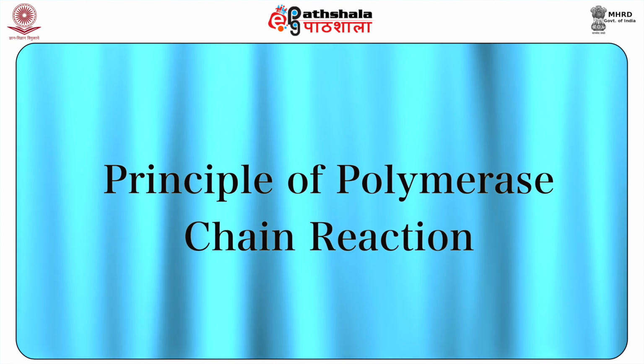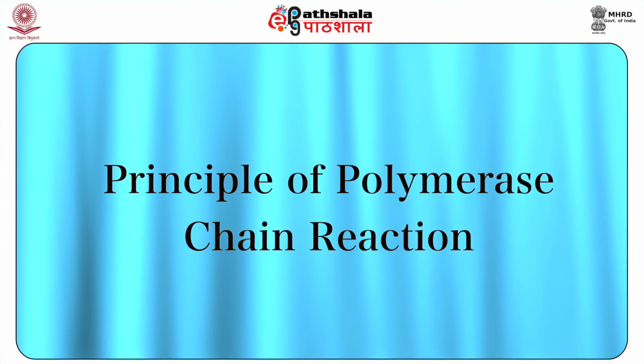Now, students, let us study the principle of polymerase chain reaction.